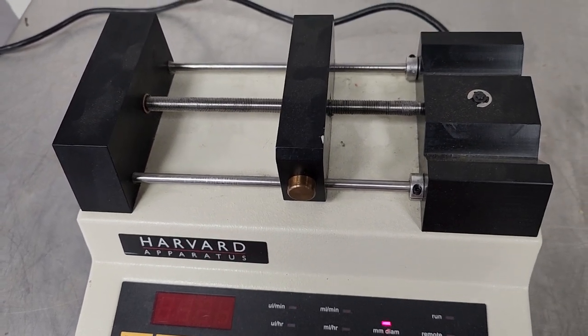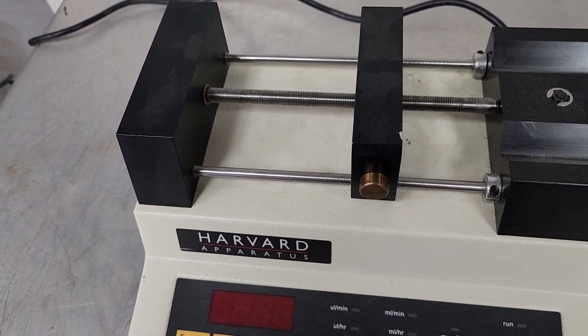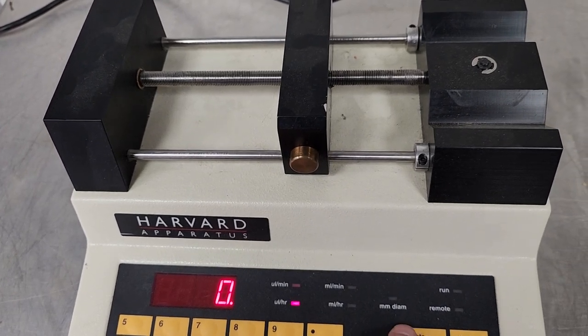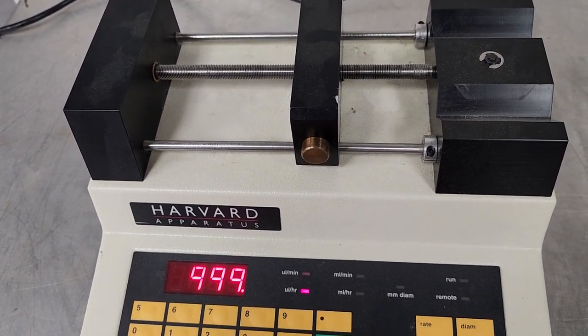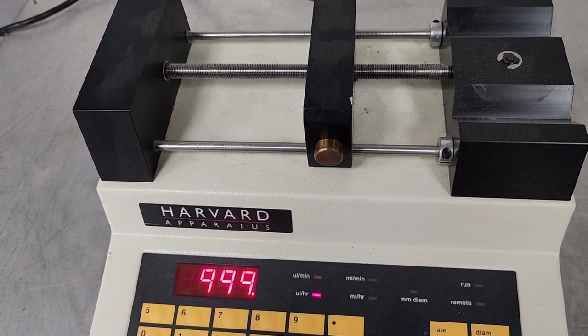So then you hit set diameter and you go, it was at 12, so let's go 50. And then you go set rate. And you go 999 and hit start. Hit set. Oh, sorry, hit enter. And then you hit.